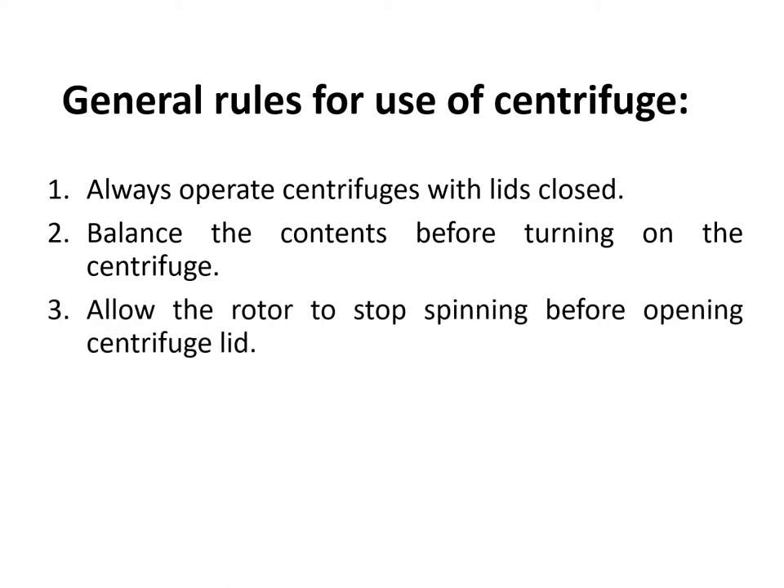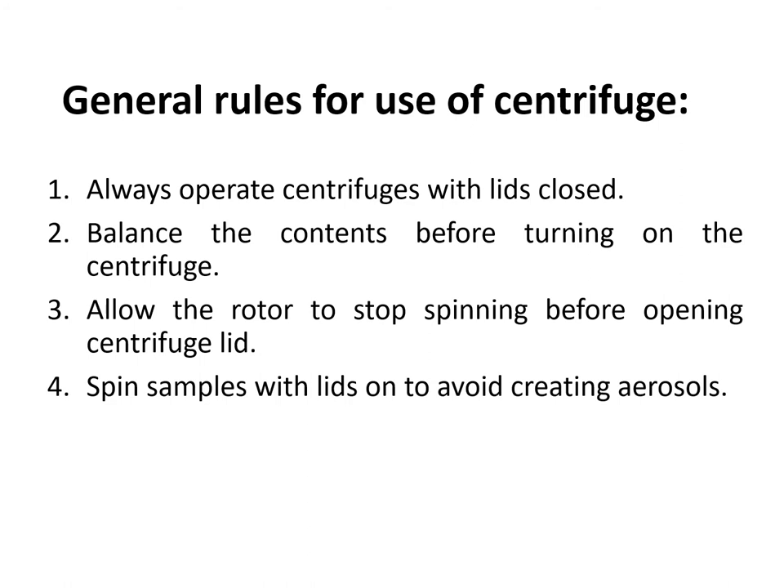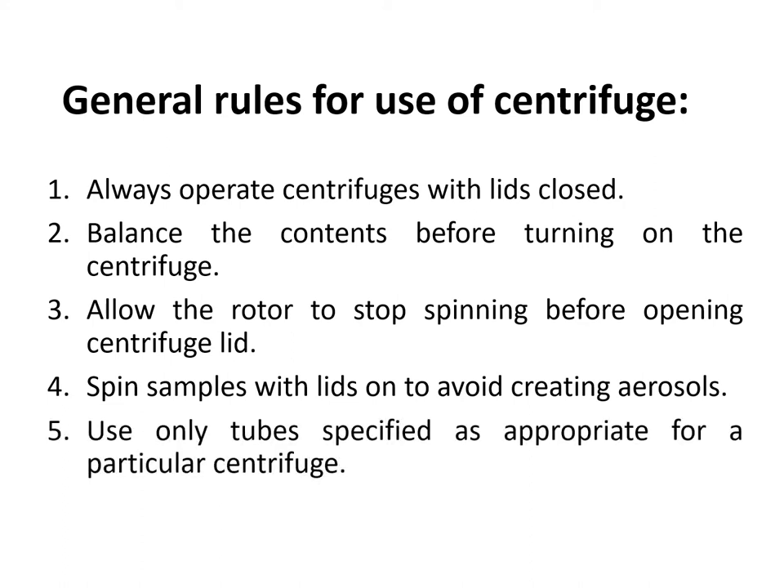Third, allow the rotor to stop spinning before opening the centrifuge lid, because forcefully stopping the centrifuge can contribute to aerosol formation. Fourth, spin samples with lids on to avoid creating aerosols — cover your test tubes properly. Lastly, use only tubes specified as appropriate for a particular centrifuge. Check that the size of your tubes fits the kind of centrifuge you are using.